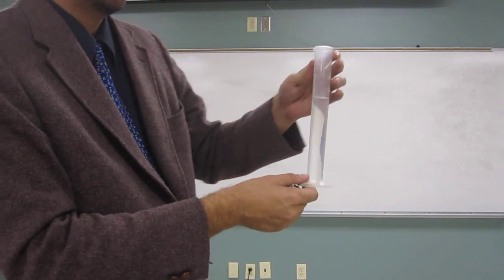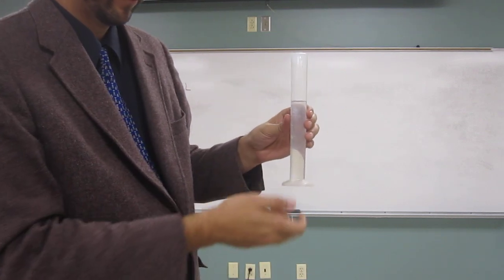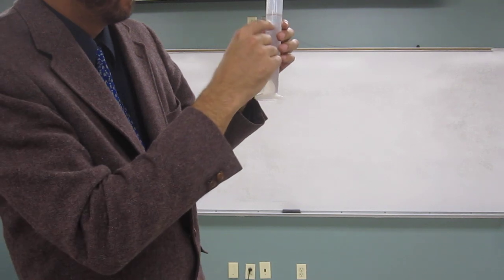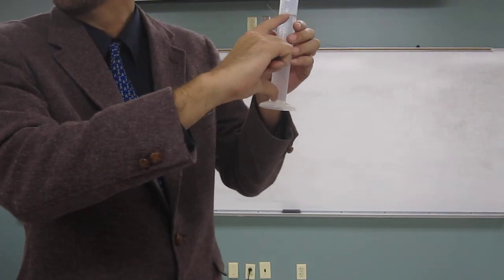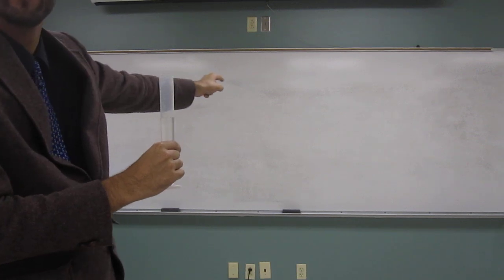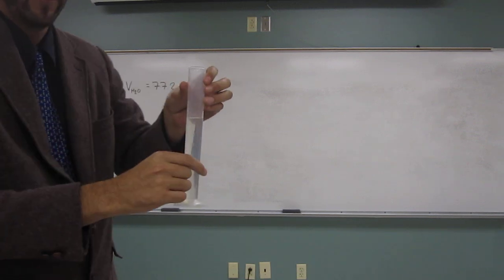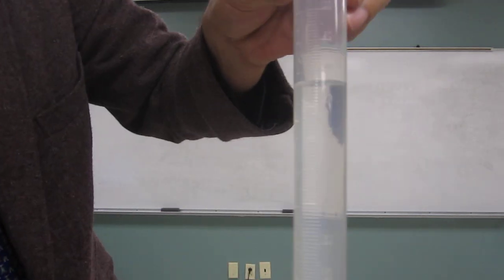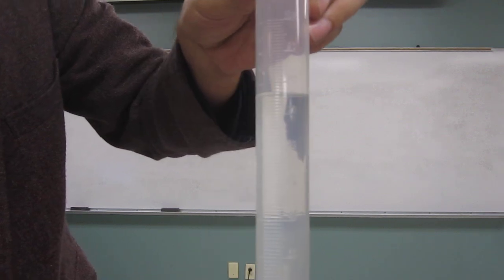Okay, so what I've done is I've taken a graduated cylinder and I've put some amount of water in here. And in fact, it's exactly 77.2 mils. Okay, and I don't know, here I'll let you see if you guys can see that on camera.